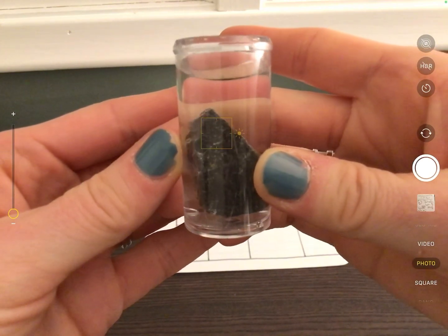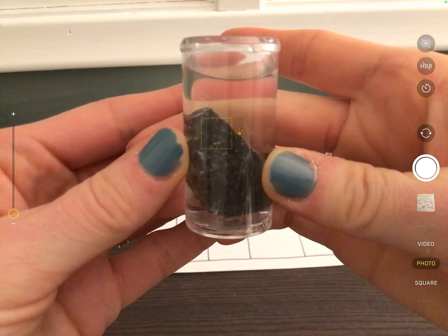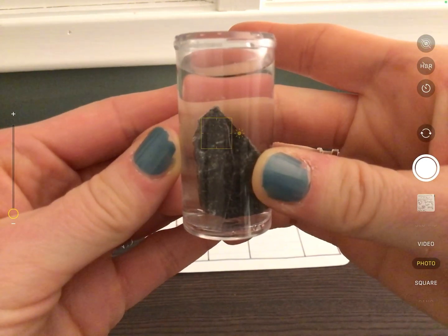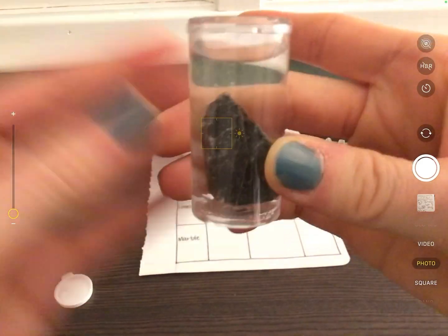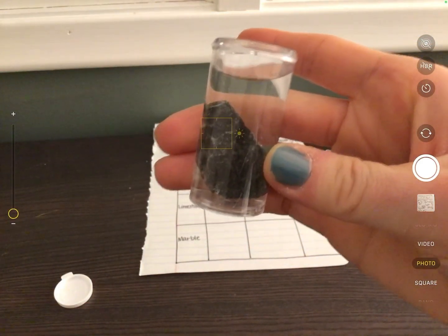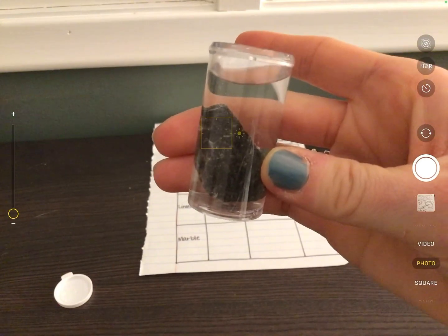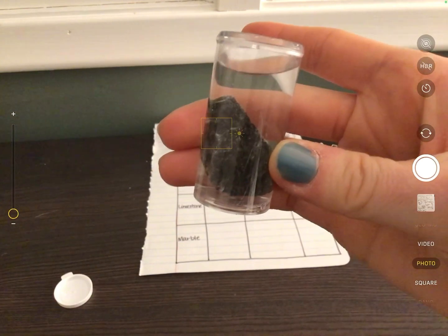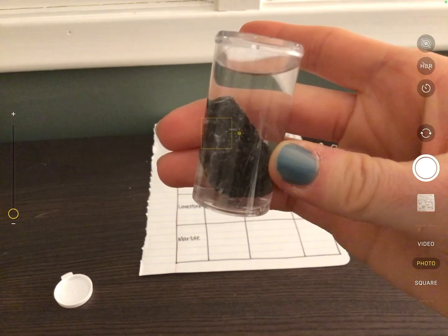What does that tell you about whether it is a chemical reaction or if they were air bubbles? My prediction is that they are air bubbles, because I think if the whole rock basalt was still reacting to the vinegar, we would probably still be seeing lots and lots of bubbles, and I don't really see very many anymore.